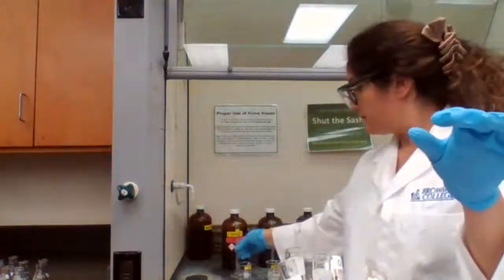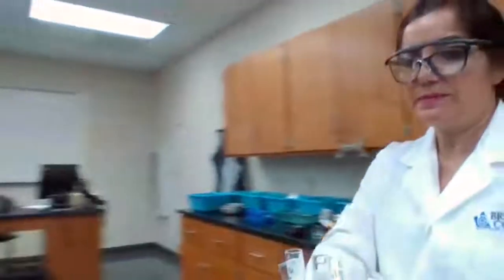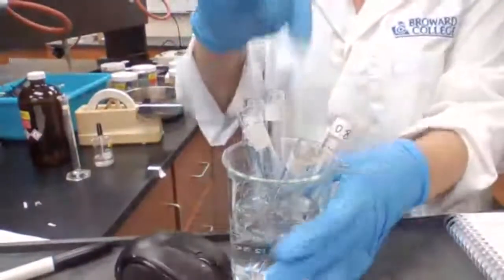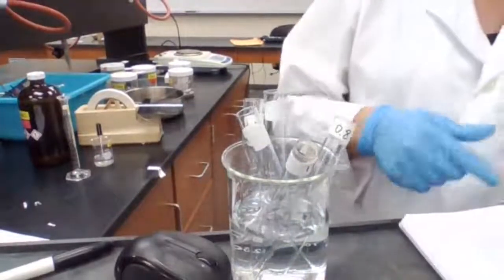Okay. We have the acids already added to the test tubes. You can see we have the acids already added.